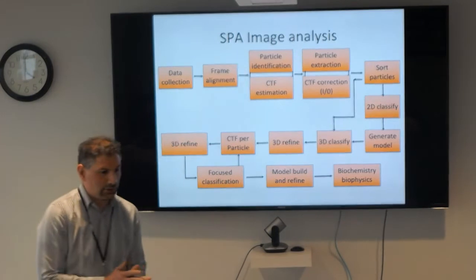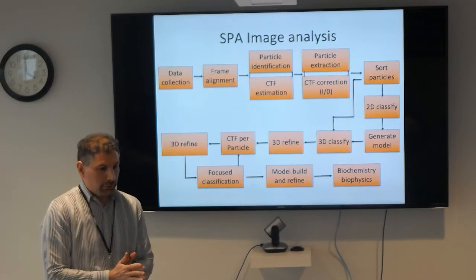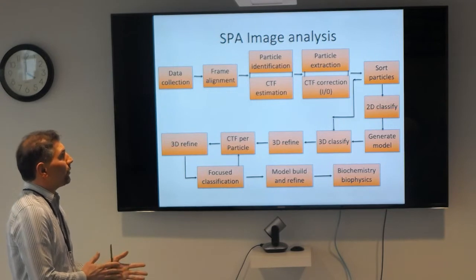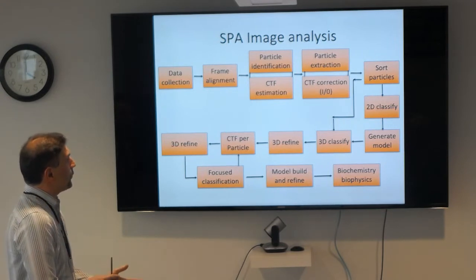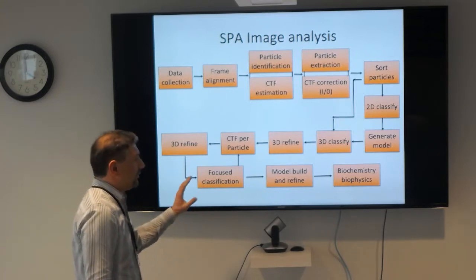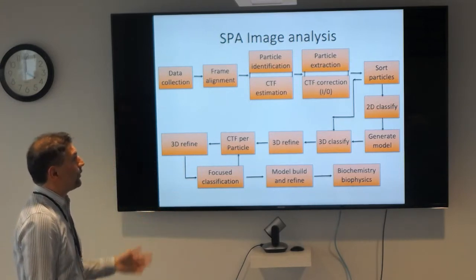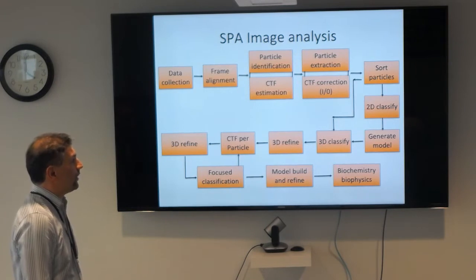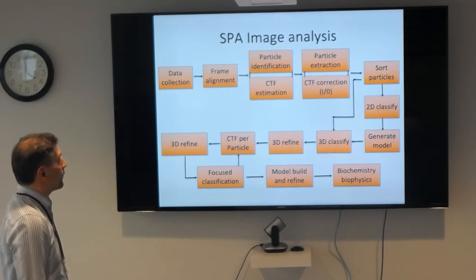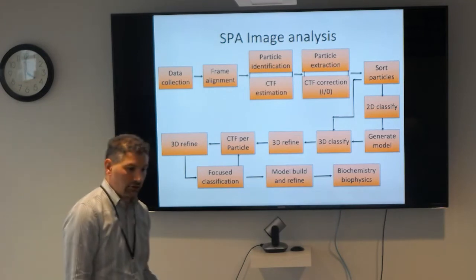Okay, so this is generally one of the routines, or a generic routine, that we use for single particle analysis. You're going essentially through different steps here, and again, this can vary. Some labs use slightly different strategies, but essentially this is all of the things that go into a workflow. You obviously start with your data collection.